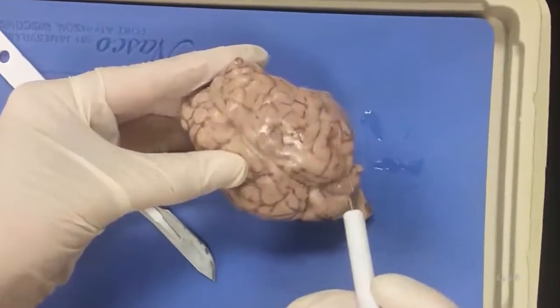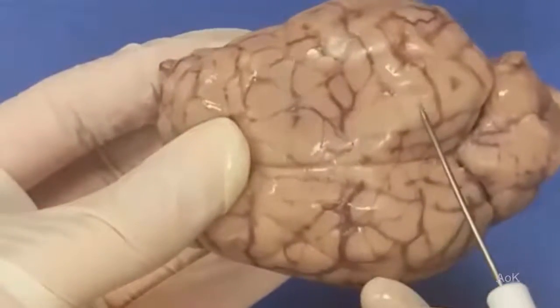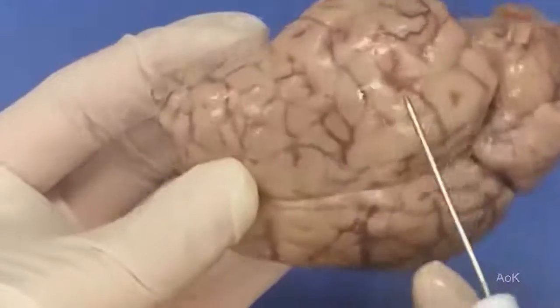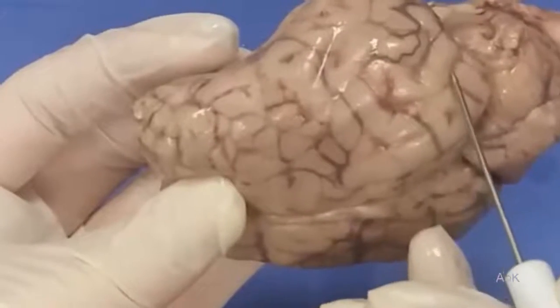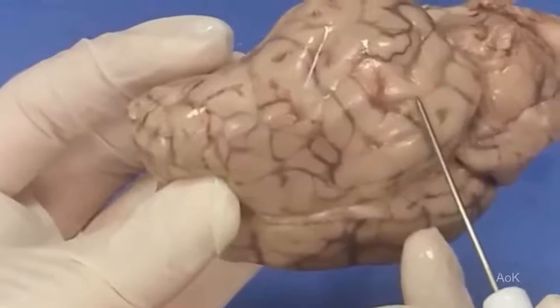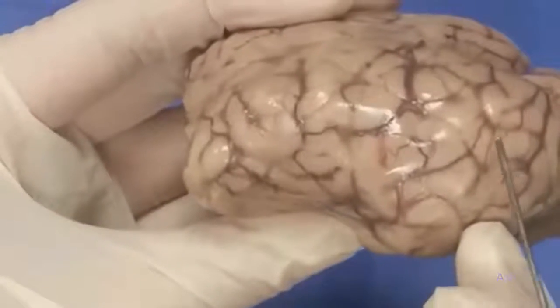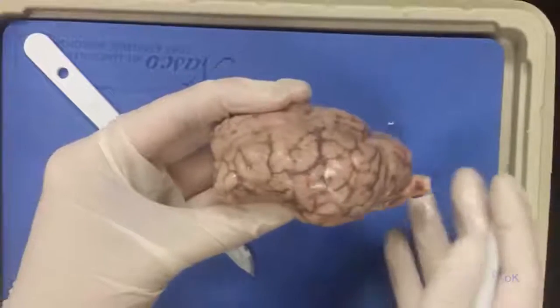The cerebrum has a bunch of wrinkles on it, and the bumpy parts of the wrinkles are called the gyrus, or gyri if it's plural, and the little gaps in between, the little valleys, are called the sulcus, or sulci in plural. On this brain you can also see tiny blood vessels that give nutrients to the brain.